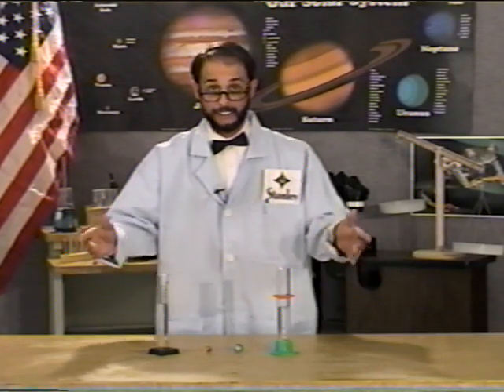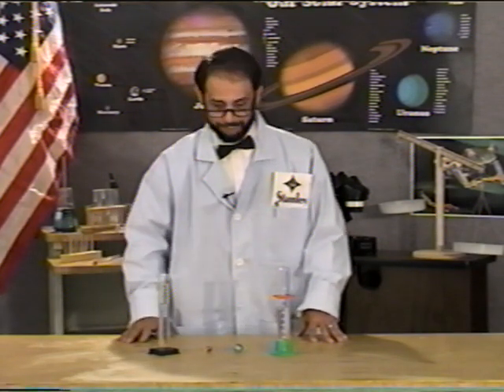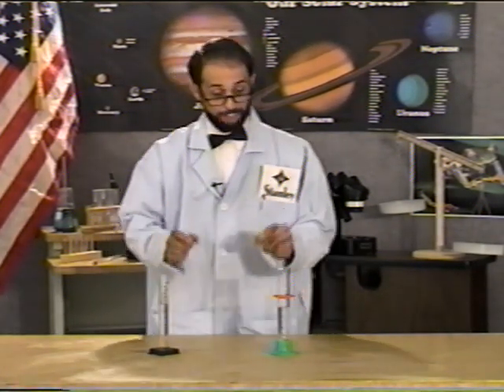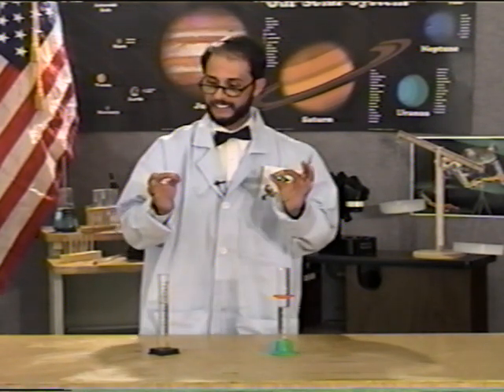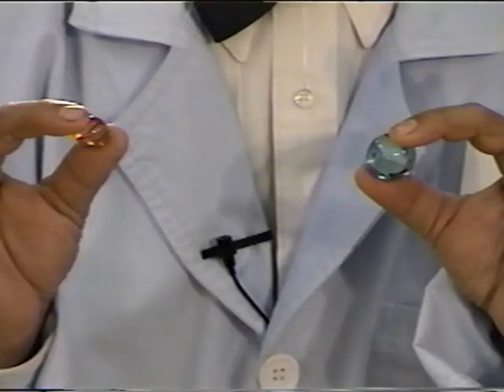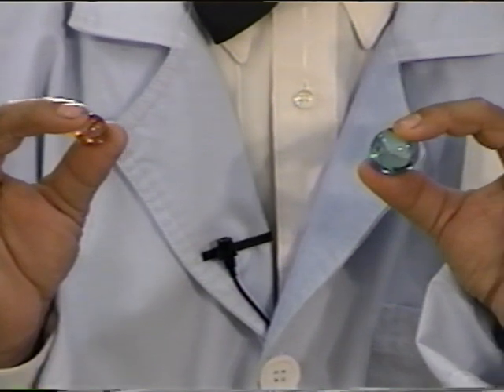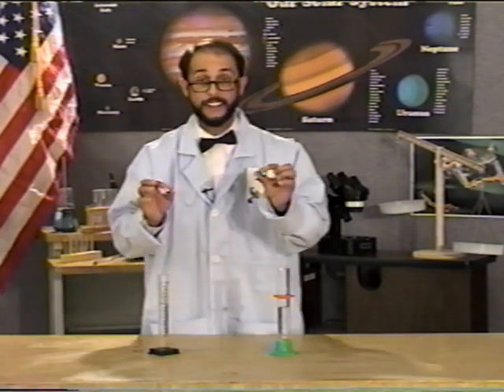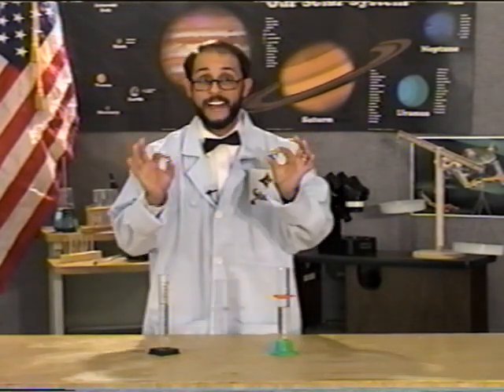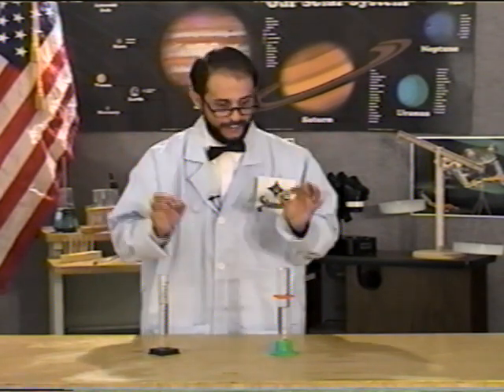Now let's do a little experiment and demonstration with something we know as volume. Volume might be thought of as the amount of space something takes up, like these two marbles. We have a large marble and a small marble. Now, to find an objective way to measure the amount of volume of each, we have to have a clever scientific experiment. This is even more useful for irregular objects, such as rocks, that you couldn't measure readily mechanically.